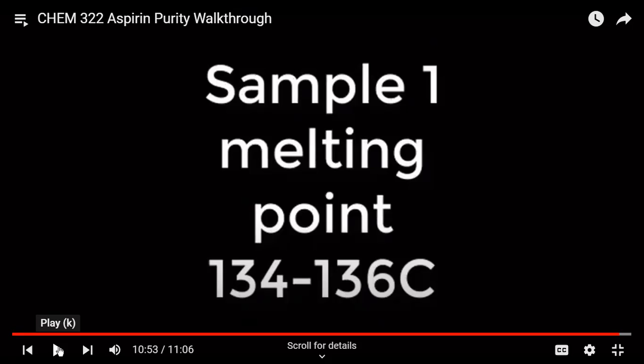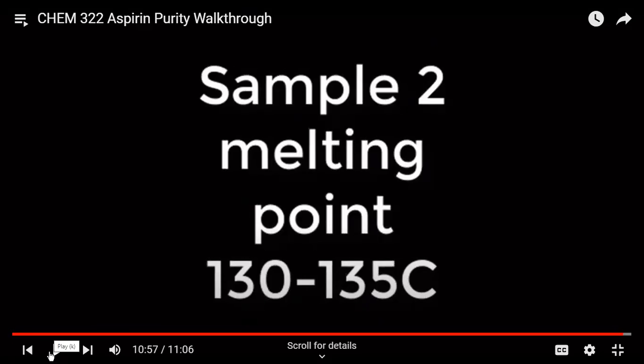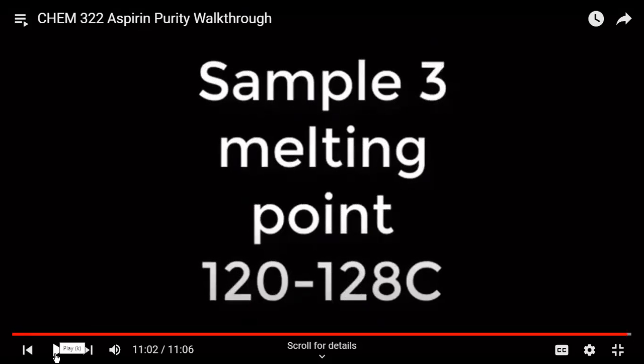If you're using sample 2, that melting point is 130 to 135. All right, and if you're using sample 3, that melting point is 120 to 128.